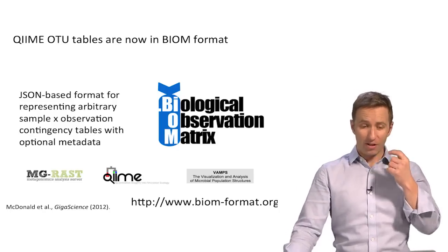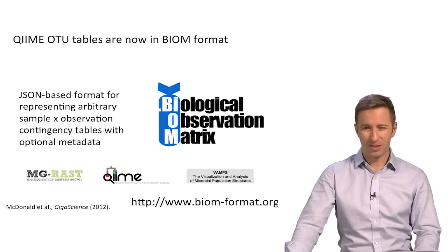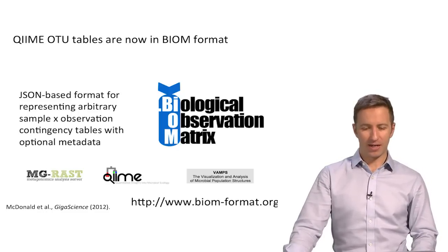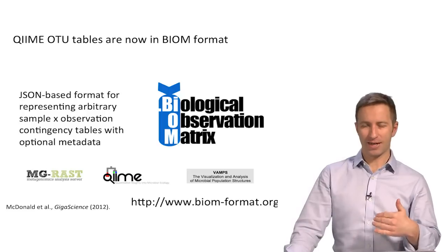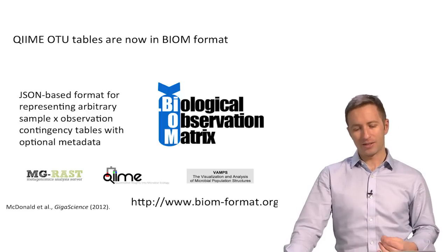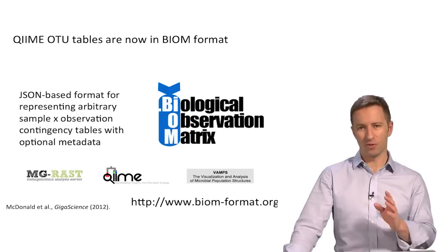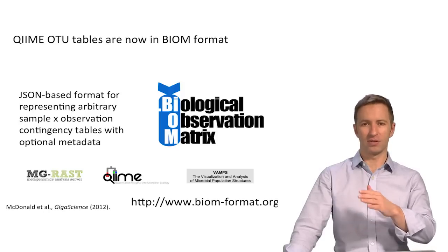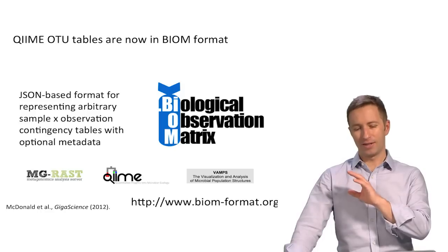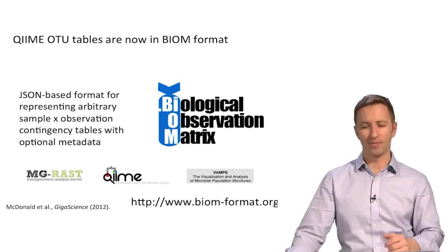One point I want to make is that the OTU tables in Qiime are now in a new format called BIOM. BIOM is not really human readable, but it encapsulates both the count data and also any of the metadata, taxonomy, and so on. And it standardizes the format so that it can make it easier for one program's output to be used in another program. And if you have a BIOM file, there are scripts that will easily convert it back to a tab delimited file.